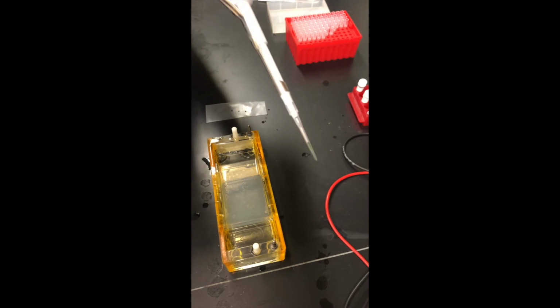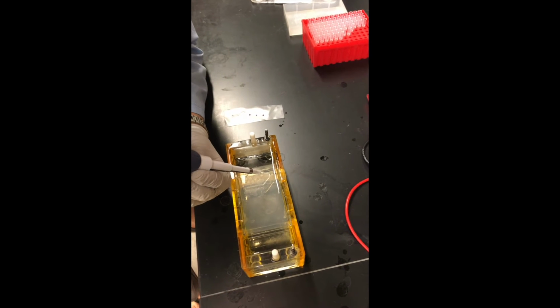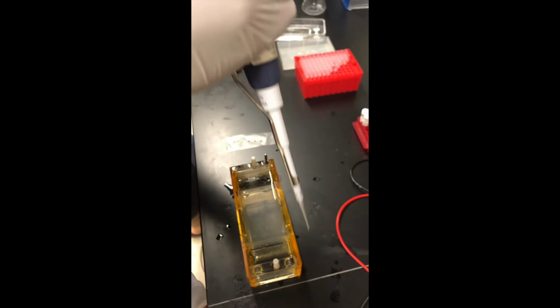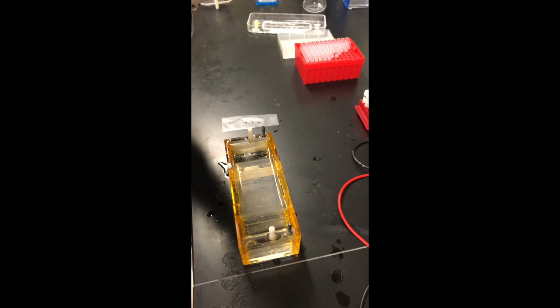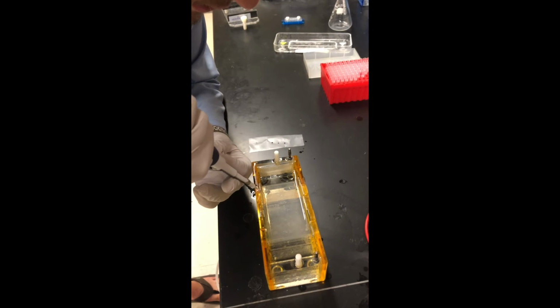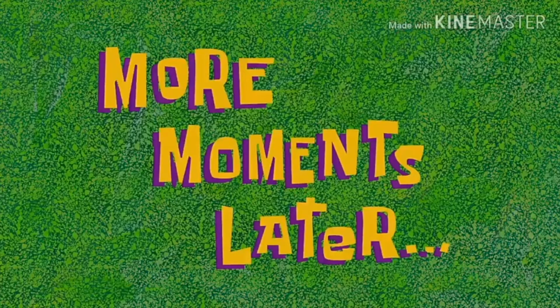Actually, I should put this back. We don't want any mishaps. Now it's time for the 100 BP ladder. Not a lot left in here, but we can probably make it work. Moments later.